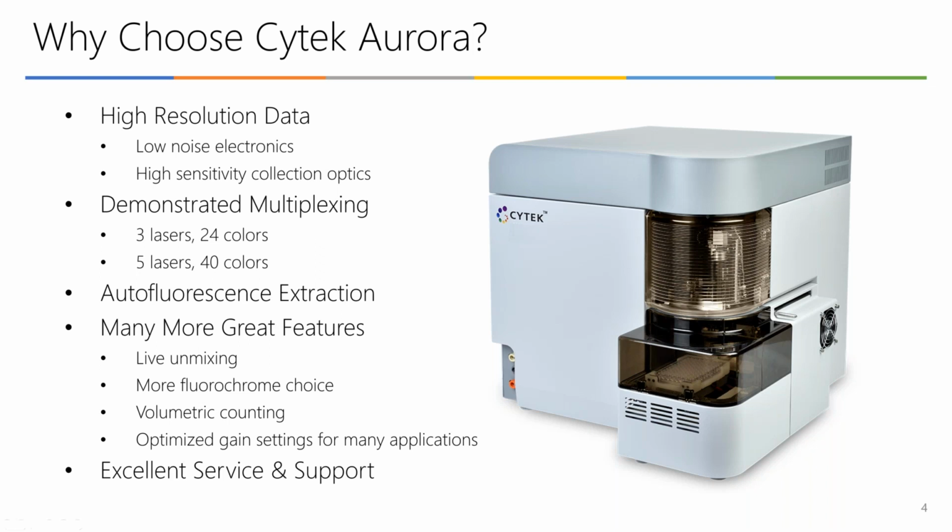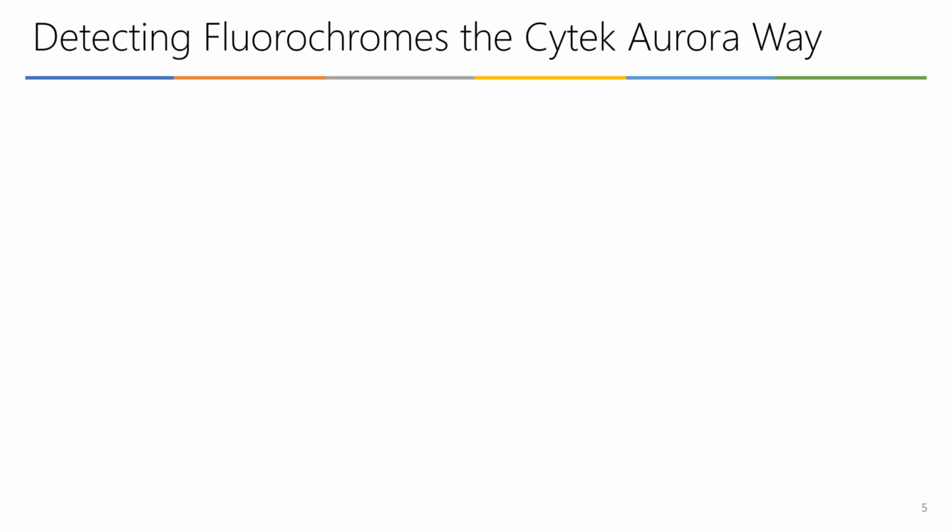We provide you with Cytek assay settings, a set of optimized gains that are going to give you great resolution for multiple applications. And in addition, Aurora owners have access to panel and experimental design support and troubleshooting assistance from our team of scientists and engineers.